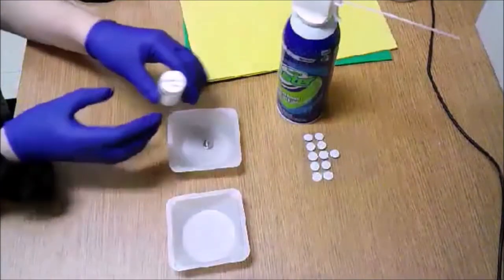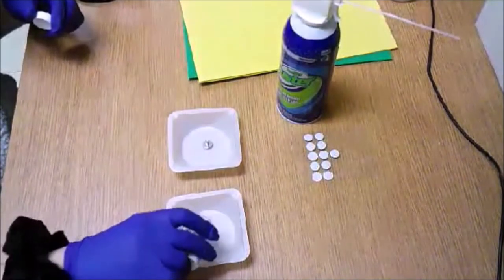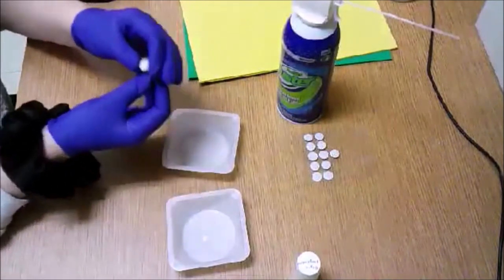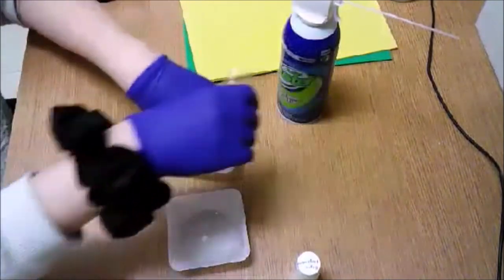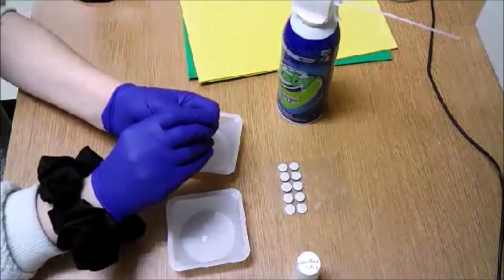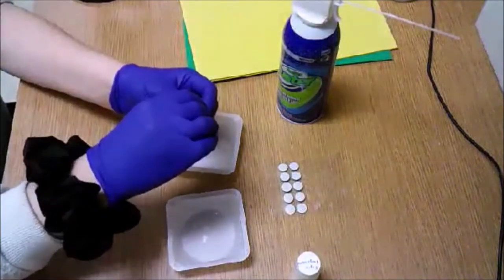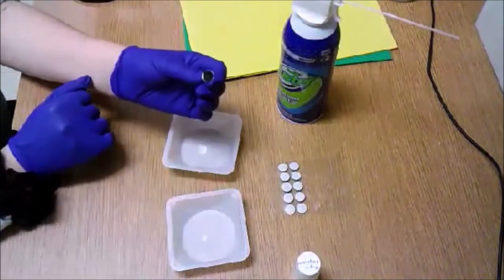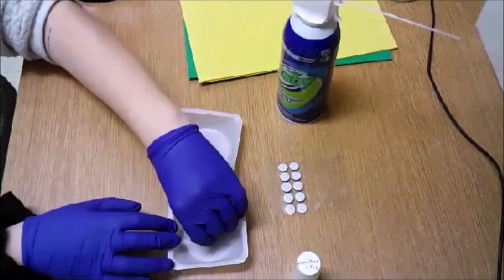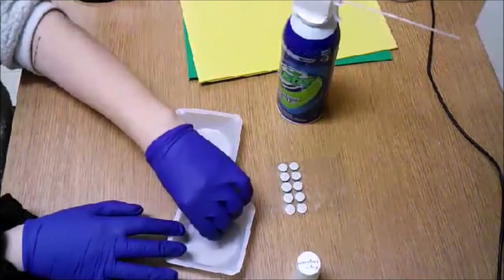First, I'm going to pour some of our sample into the weigh boat. You really don't need very much to test it on the SEM. From here, I'm going to prep our stage by adding the double-sided carbon tape. You will simply remove a piece of the carbon tape and put it onto the stage. Now it is double-sided, so all you have to do is take off the other side of the tape to expose the sticky surface. From here, we are going to dip it into our sample until it is reasonably coated.